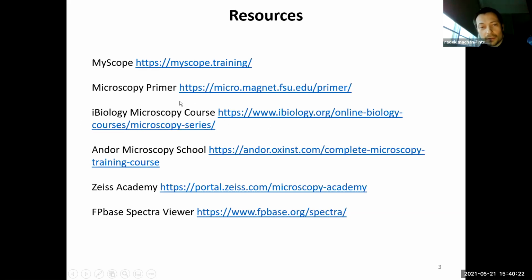Another thing is on the iBiology website, they have a microscopy course. It's a series of talks, of presentations which explain optical microscopy for biological applications.